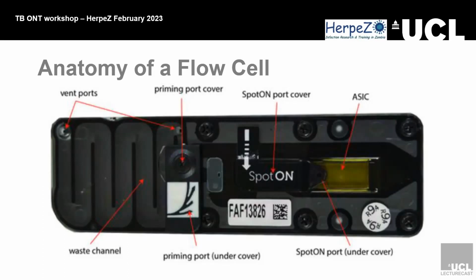So depending on what organism you're sequencing, you can gauge your costs, like how much it's going to cost. You should in theory get X amount of reads out of any flow cell, depending on how many active pores there are. So right before you even start, you might want to consider how long the genome is or what it is you want. If you are just looking for, say, 16S, or you're doing whole genomes, like with TB, 4 megabases, that's obviously quite a lot, but also you want to know how many reads or what depth you are aiming to get.